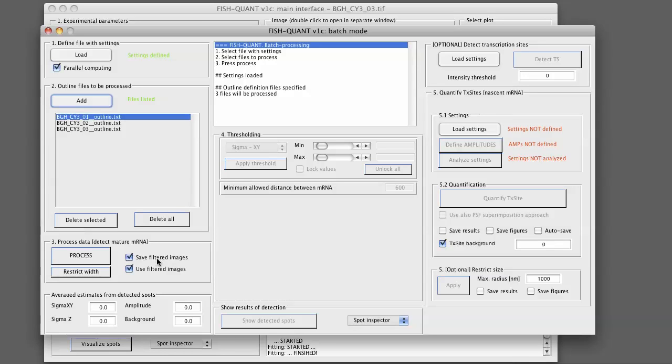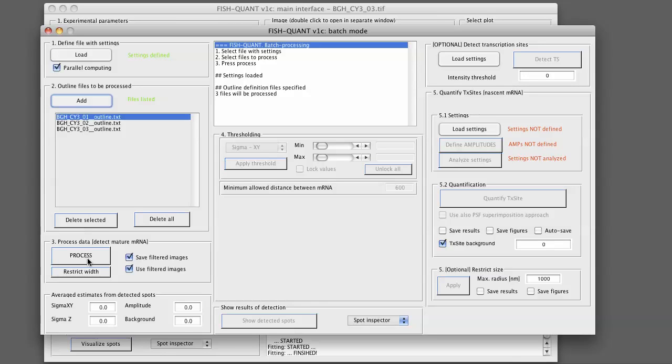We then simply click on process. What will happen now is that FishQuant will go through those three outline files. It will first perform the filtering step, then it will detect and fit all of those spots. As soon as this will be done, you will see that here a plot will populate. That will again show all of the detected parameters, but this time for all of the spots. I will press process and then pause this video because this takes a minute or two and will come back as soon as the processing is done.